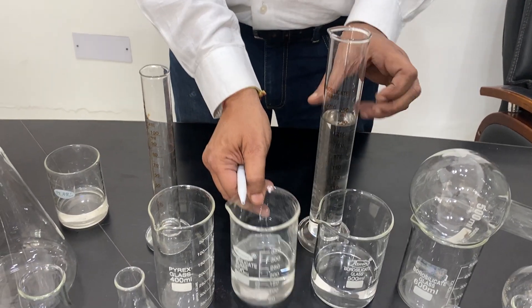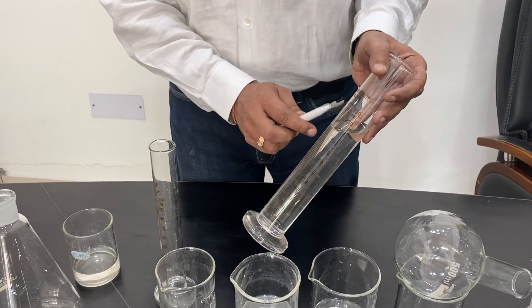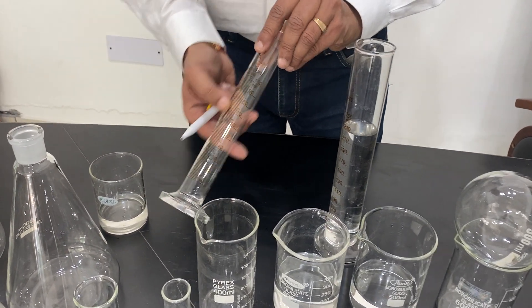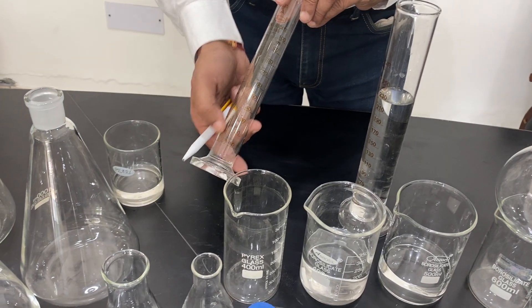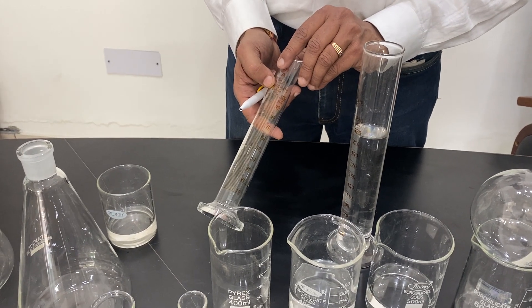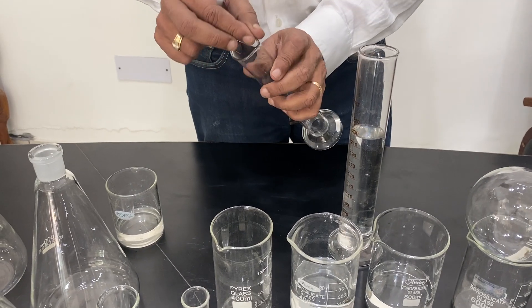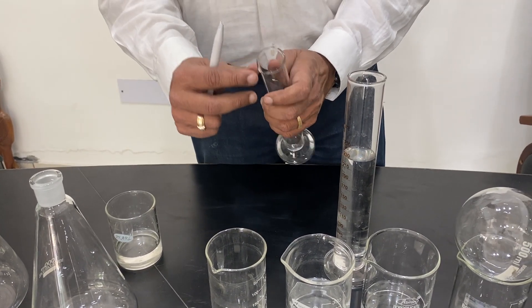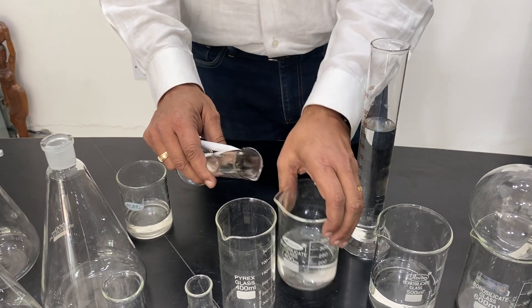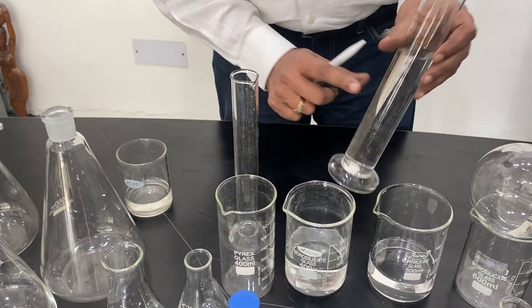Beakers give only approximate measurements. Measuring cylinders are more precise — if it is Class B, it is close to approximate, and if it is Class A, the graduation is quite accurate: less than 1%, around 0.5% or 0.01% depending on the requirement. They come with a pouring lip and rim on top, so you can pour the chemical out easily and pour back the solution.